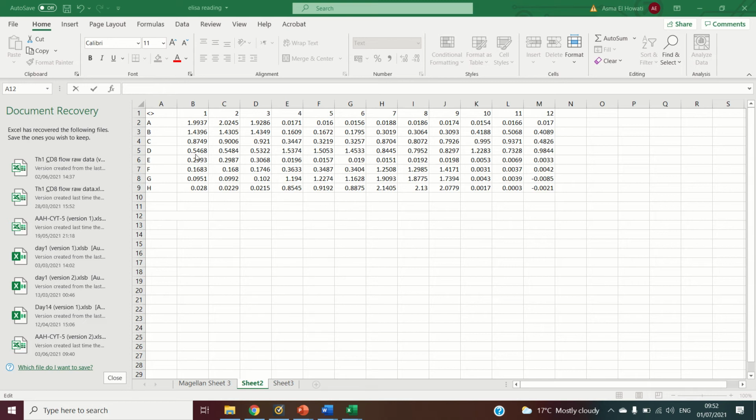So to start with, you will have your plate reading. So these are the absorbance values from the plate reading. And in the first three columns here, I've got my standard concentration. So these absorbance values, I know what the concentration of the material that they reflect. These absorbance values of my sample, I don't know.